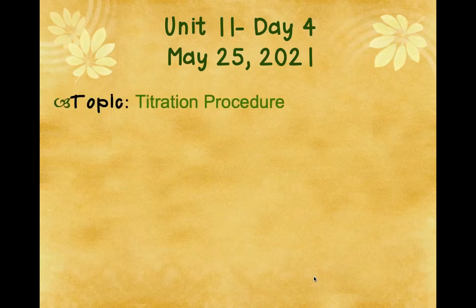We're going to talk about the titration lab procedure today, and I'll actually show you an example. This is assuming you already know a little bit about what titrations are and what kind of data you need to get. This will just show you what to do if you needed to set up an actual titration and take data.